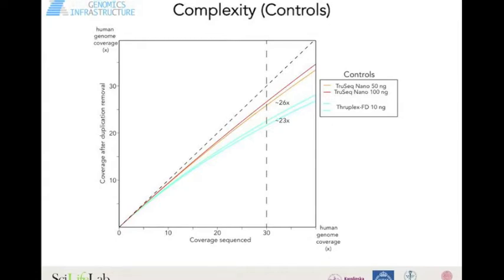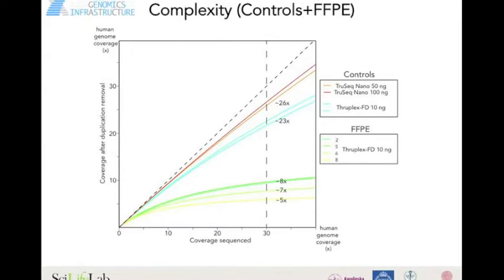And if we then look at how it turned out for FFPE, you see the impact that these types of fixation protocols have. Sequencing more than 10x is mostly wasting reads. For the two worst ones, which we highlighted on the gel images, we see that we can produce maybe 5 to 7x from these samples. So we produce stable libraries, but we can't deliver 30x genomes.